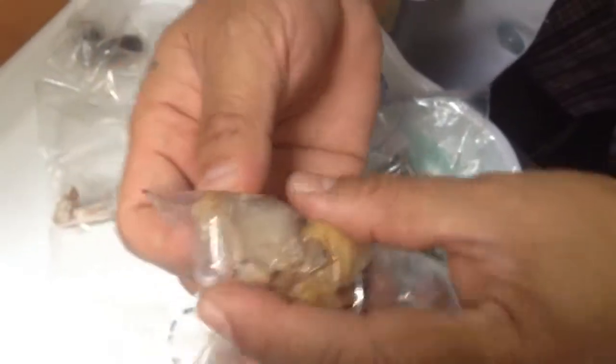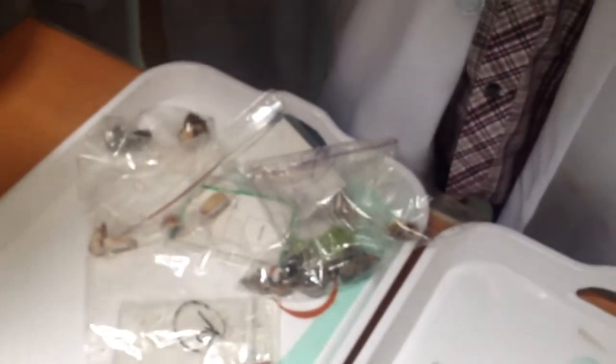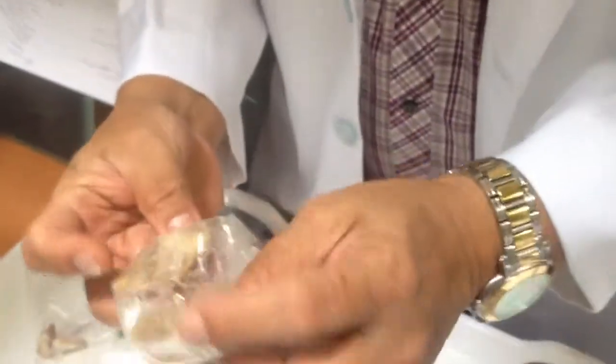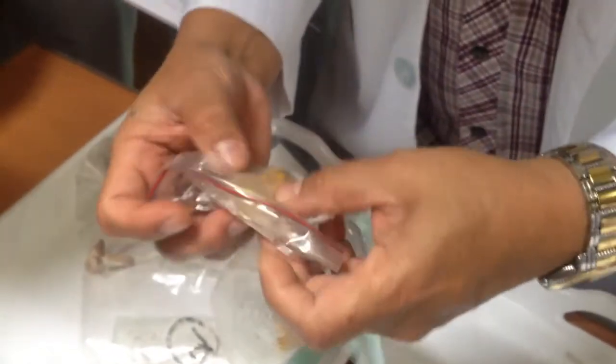So all of this, especially this one. Like this one. Mucin, gelatin are translucent. Okay? My hand is opaque. But when you see through, that is translucent. So this is translucent rather than opaque. All of this.